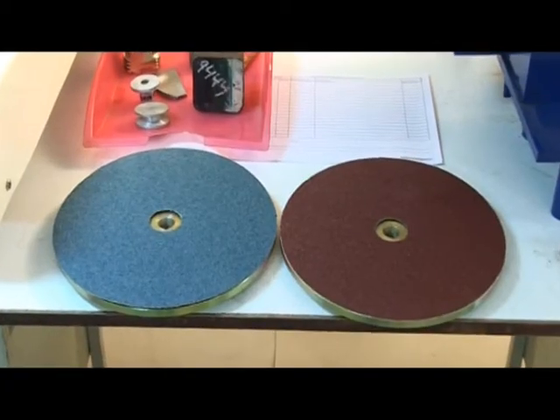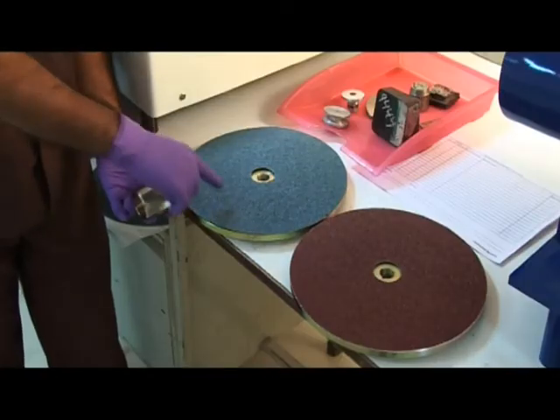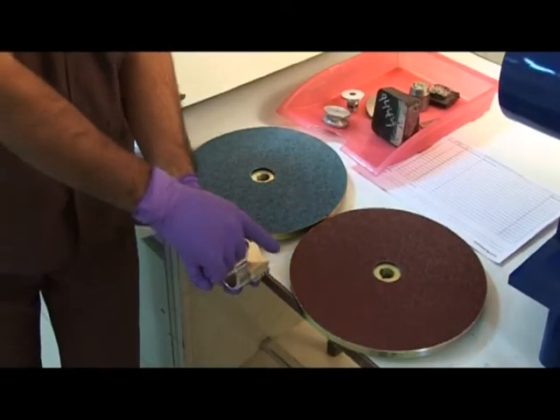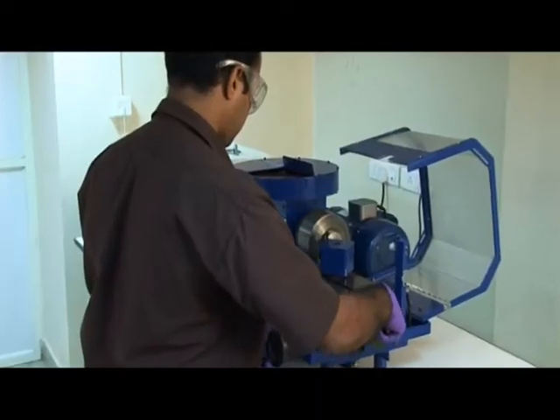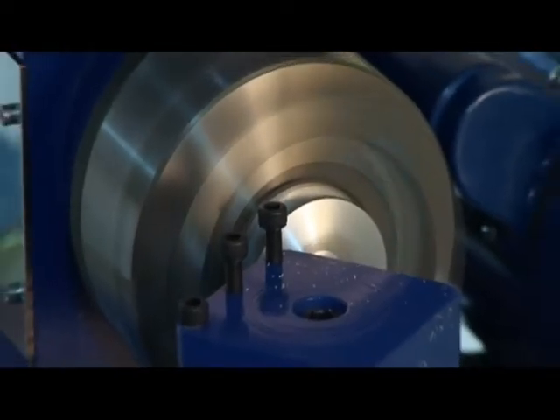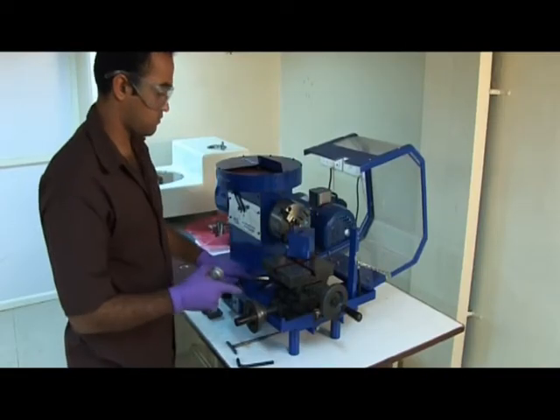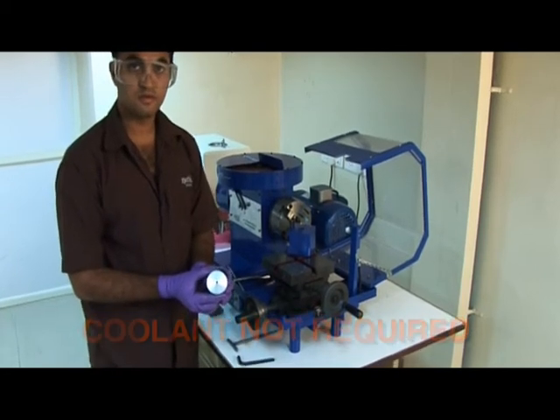Ferrous metals have higher hardness and are normally ground using abrasive aluminum oxide or zirconia discs. On the other hand, non-ferrous metals are softer and are normally turned or milled to the required finish. Coolants are not normally required for such operations.